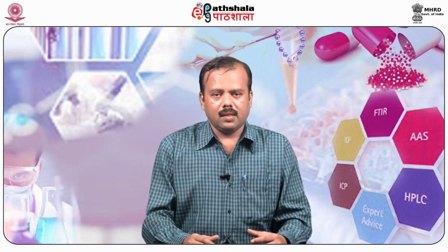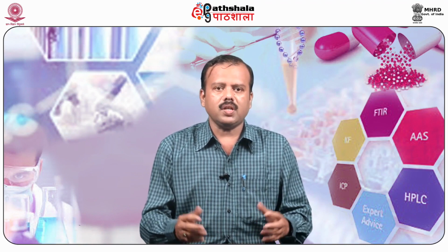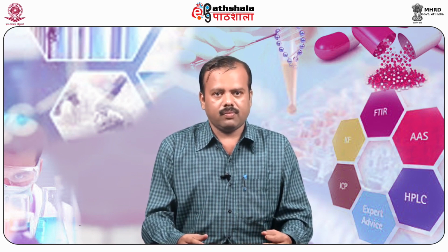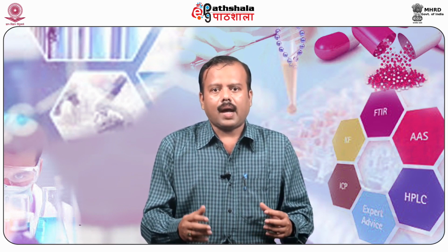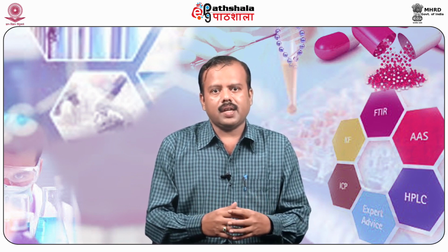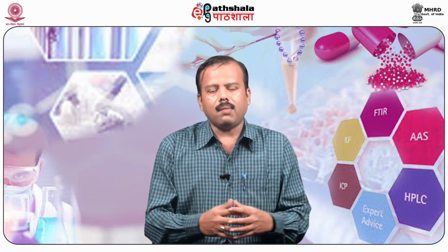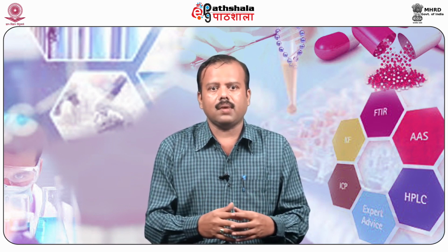Microbial growth analysis. The microbial growth analysis can be carried out by biomass. Mostly when fungal growth is analyzed, the biomass is measured. Respiration, that is the oxygen level or carbon dioxide level, is also an indicator for microbial growth. The dissolved oxygen level always reduces when there is heavy microbial growth, and vice versa, the CO2 level, that is carbon dioxide level, also increases when there is heavy growth of the microbial cells.